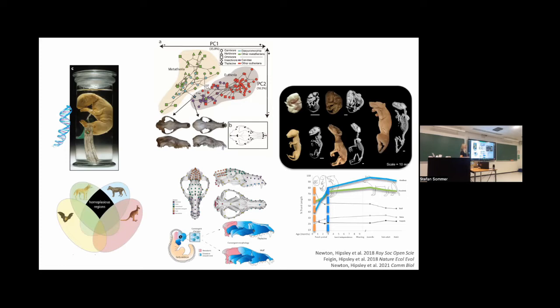And the thylacines are very small. So from this, we can say, actually, we think it's a dunnart. Sorry, museum, and sorry, us, the number just went from 13 to 11 pouch young specimens known in the world. That was not our point. We actually wanted to look at development of forelimb versus hind limb, getting into some different marsupial developmental biology, but that was one of the outcomes that happened from this type of technology using CT.